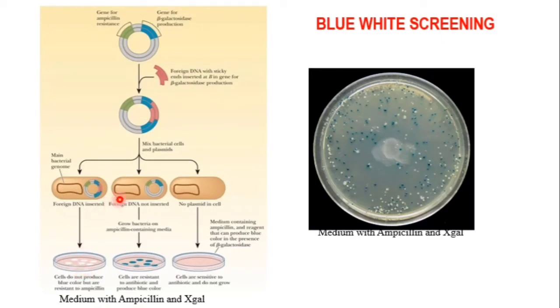Another type of bacteria in this mixture has no insert in the lacZ gene, so the lacZ gene will be active.